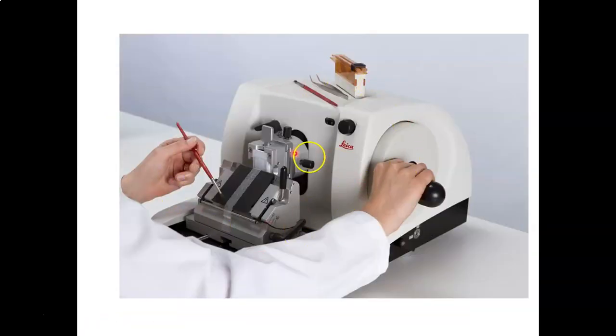Let's see the technique of sectioning. You could find it in many YouTube videos. Here, the doctor or the technician used the microtome to section the block into thin serial sections. As you see, thin serial sections.